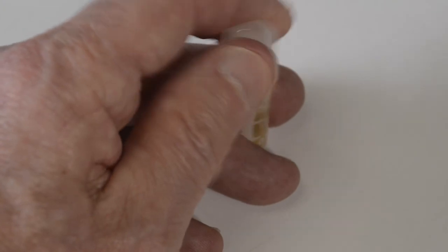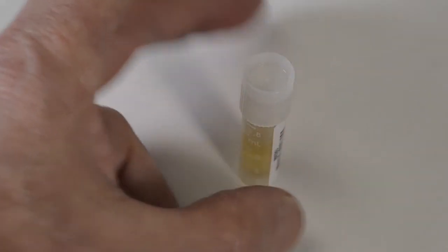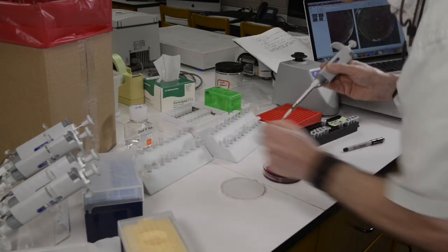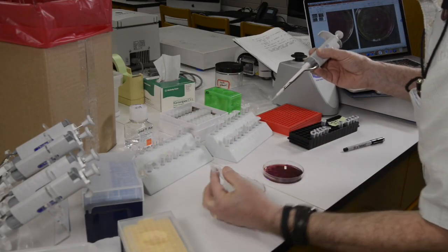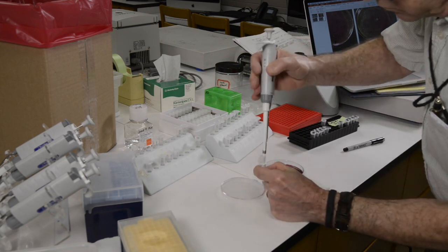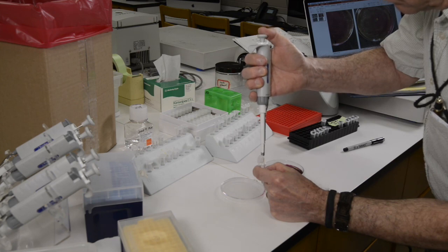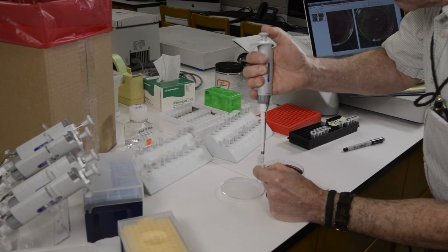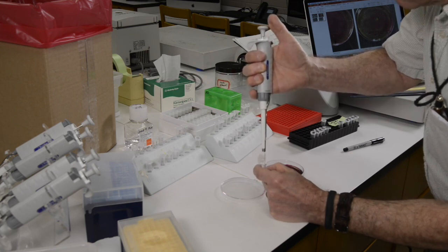The pipetter now can be used to make a bacterial suspension. Without setting down the pipetter, I'm going to go directly into a tube containing the 100 microliters of molecular grade water, and I'm going to pipette up and down to mix bacterial cells into that water, just as I'm doing here.